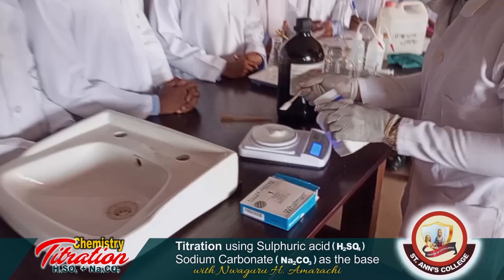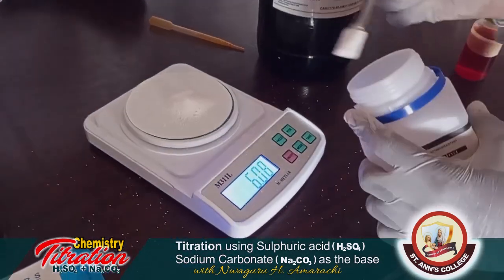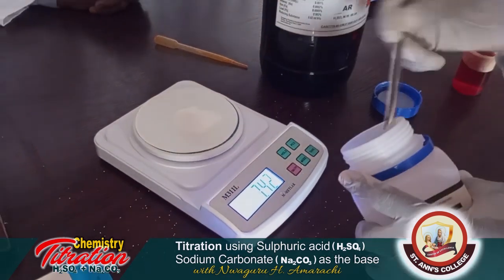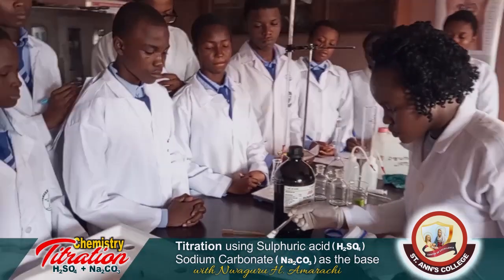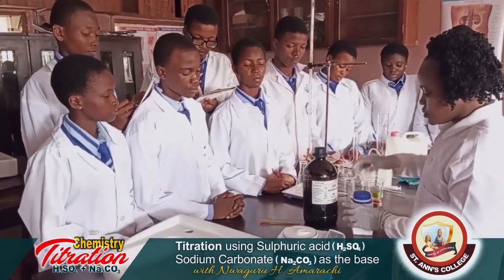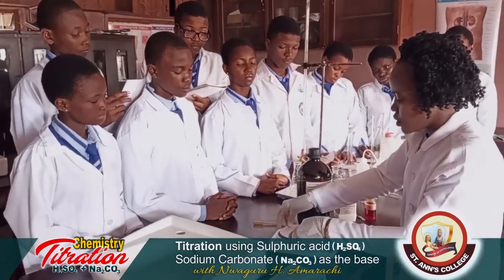Take your time to make sure that you get up to 7. Now we have 7 grams of our sodium carbonate.